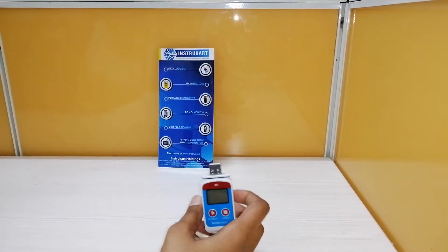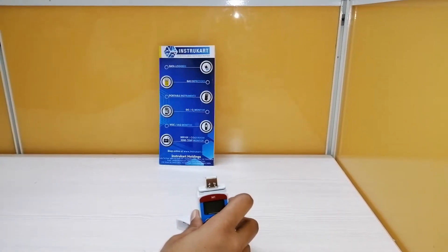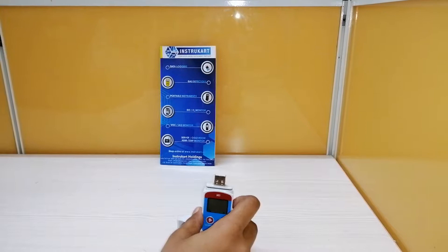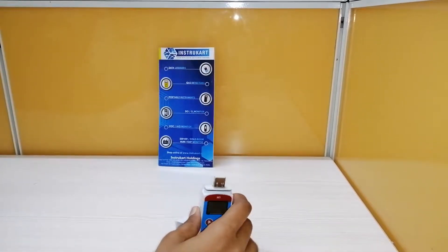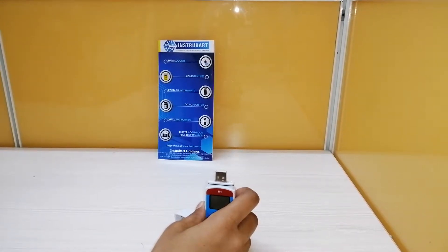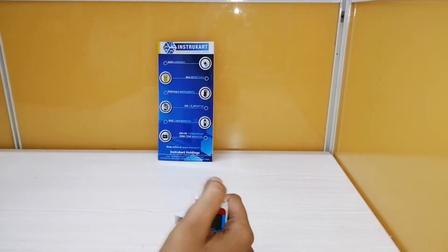It is multi-trip capable, making it a multi-use data logger. Temperature accuracy is adjustable and you can also adjust the sensor in very critical conditions. This data logger is GDP compliant and EN12830 compliant. It has a battery lifetime of at least six months at 25°C if the recording interval is 15 minutes. The report type is an encrypted PDF file.